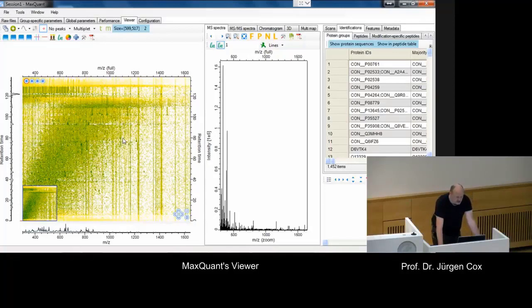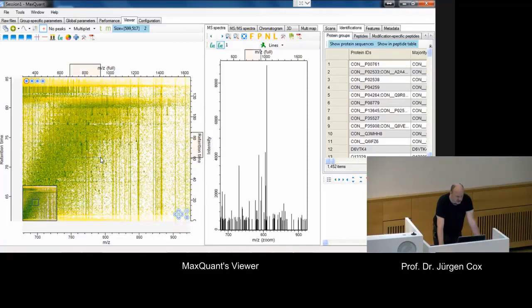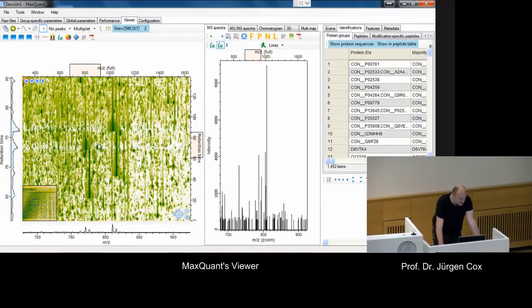And so this has the usual zoom, move, select functionalities that you would expect from a map view, basically. The simplest is you can zoom in, with the drag rectangle here, then you would go into this region. So it takes a little bit. Yeah, so now we zoomed in a little bit.